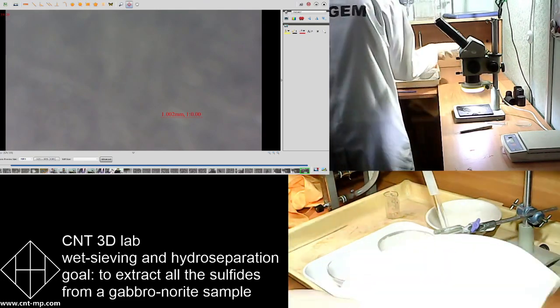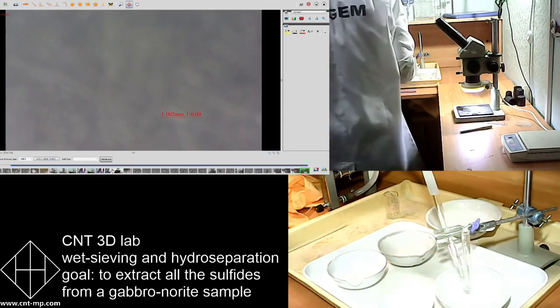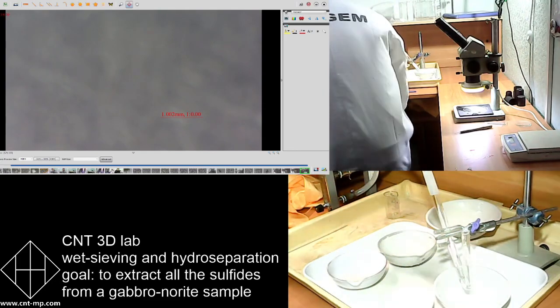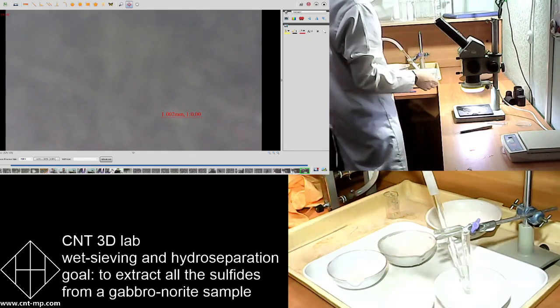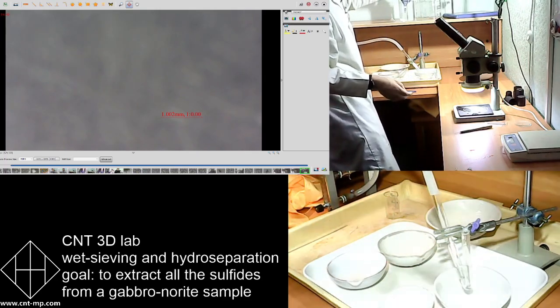But the first stage, whenever you make the concentrate with the long glass separation tube, is really the cutting of the size or amount of the specific fraction. And that is less sensitive than the next stage on the shorter tube, where you separate very, very precisely by physical density.